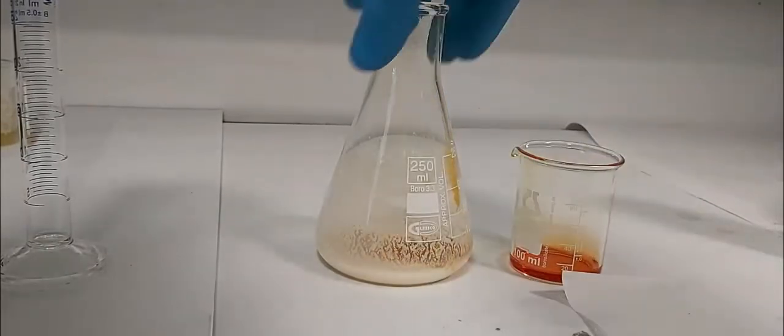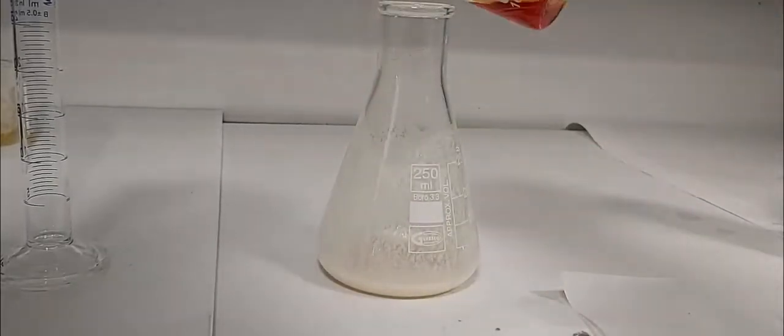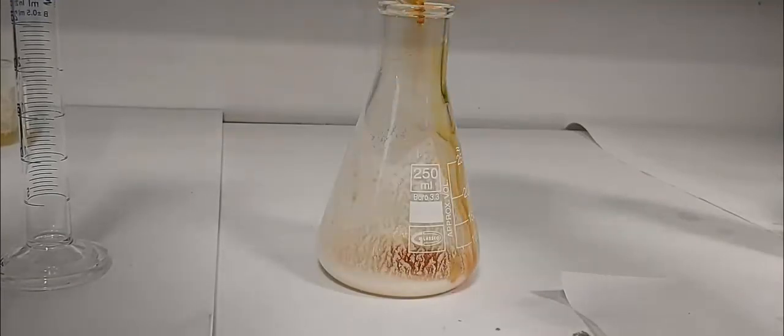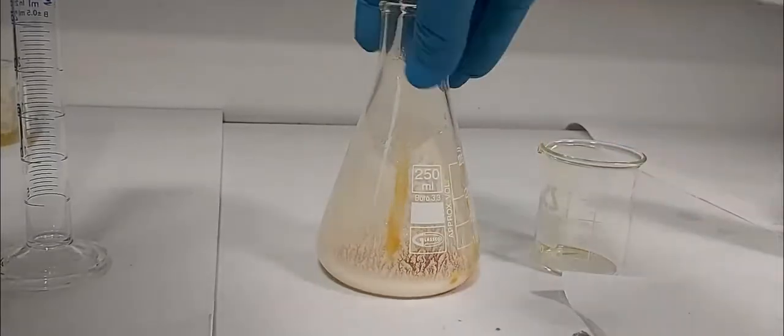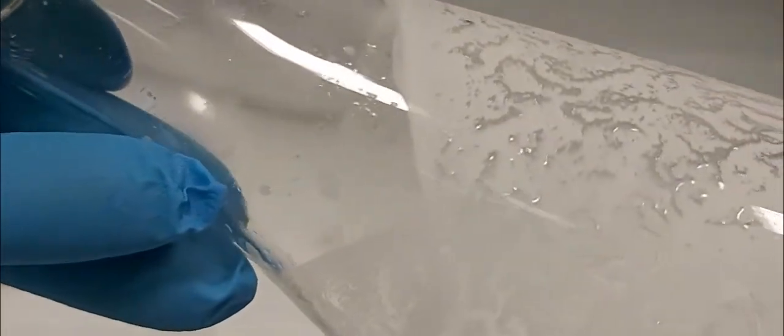We continue the dropwise addition of all the solution. Then we stir — the color will disappear. We have a beautiful precipitate forming; you can see it on the border of the flask.